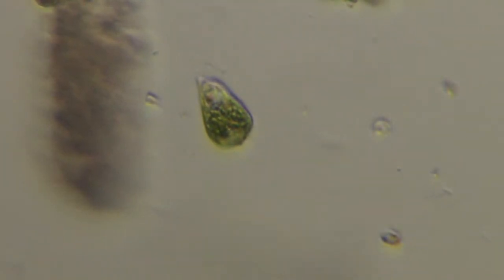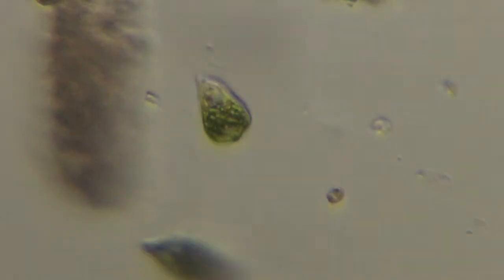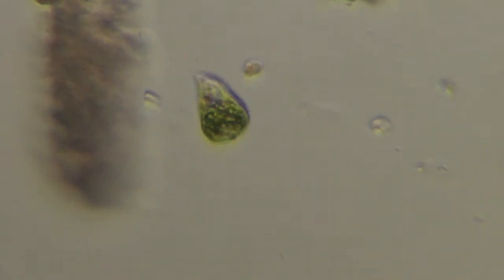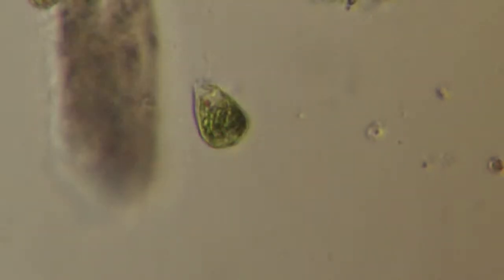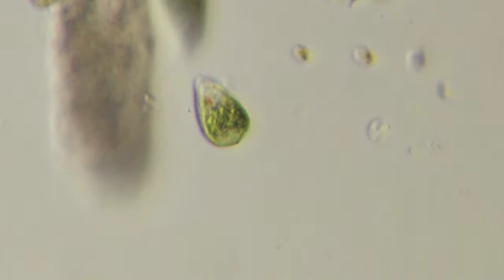I wish, unfortunately, the eyepiece looks so much better than the camera. I misplaced my DSLR adapter so I can get better images with the DSLR.